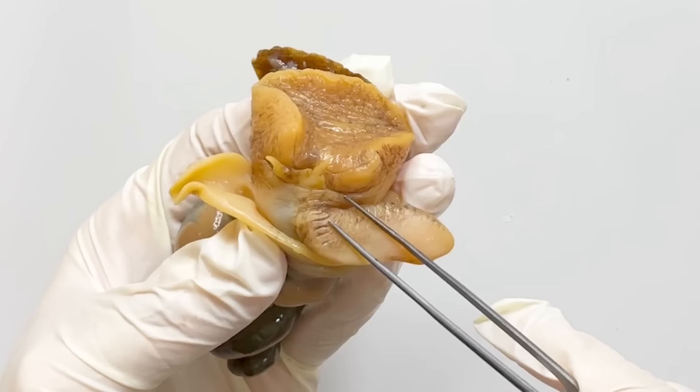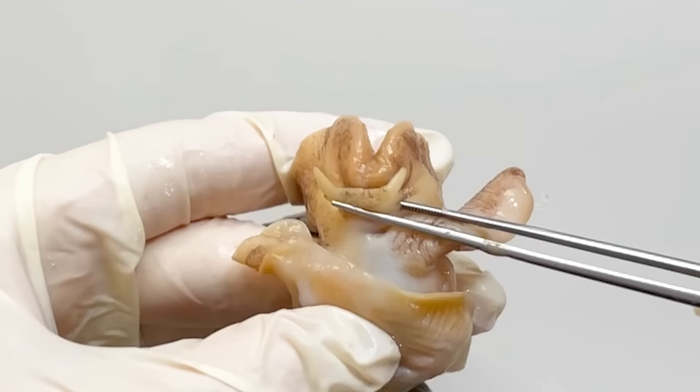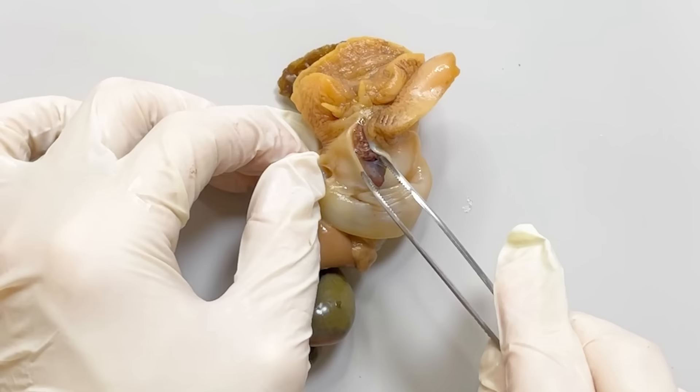On the opposite side of the operculum, you can find the whelk's facial features — its tentacles and eyes. When you flip the whelk's face, you can see a hole where a tube-like proboscis emerges and retracts. By cutting the back of the head, you can extract the tube-like proboscis.